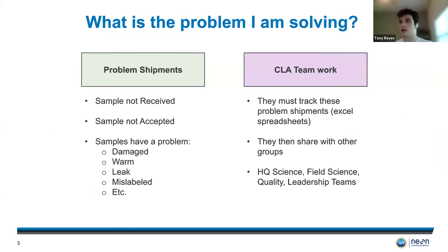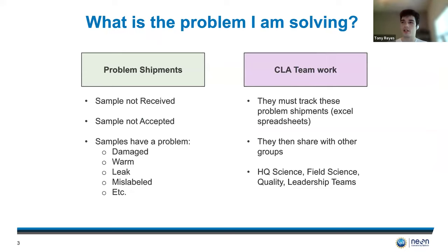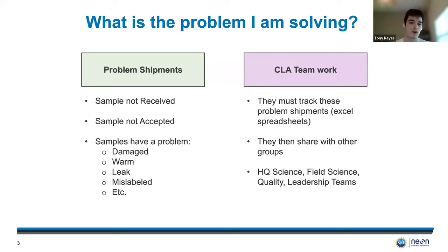So what is the actual problem that I am solving? The thing with the samples is that all of the shipments that contain the samples can have some problems. A couple of the samples are not received; some of them are just not accepted, and even if they are accepted, the samples can still have problems. Here are some examples: damaged, warm, leak, or mislabel — there are many more.